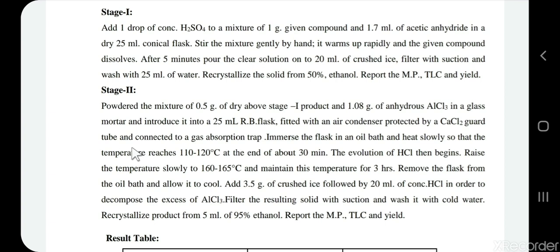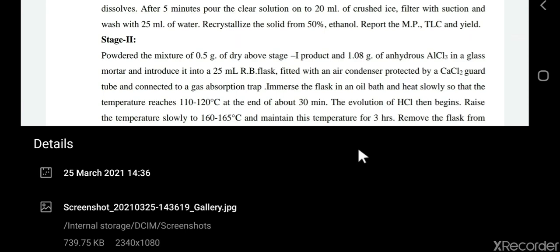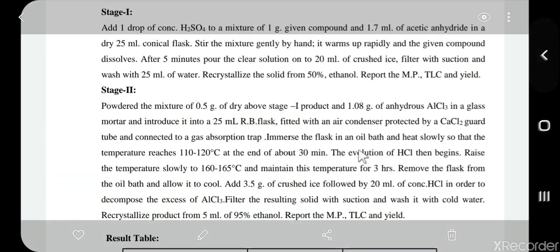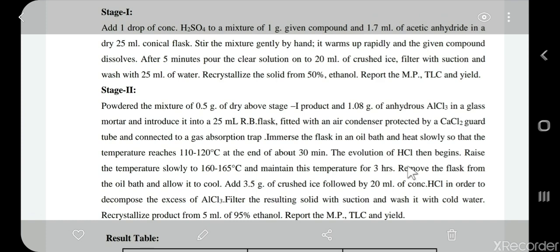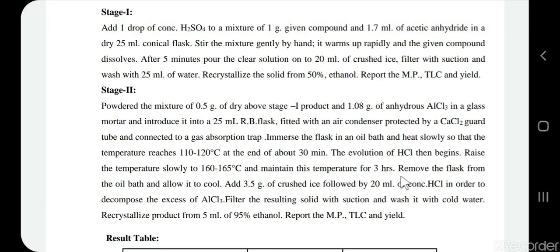Now we heat the flask to 110–120°C for 30 minutes. The initiation of reaction will be confirmed by the evolution of HCl gas. Once HCl gas evolution begins, we raise the temperature to 160–165°C and maintain this temperature for the next three hours. If we maintain this temperature for three hours, the reaction will be completed.